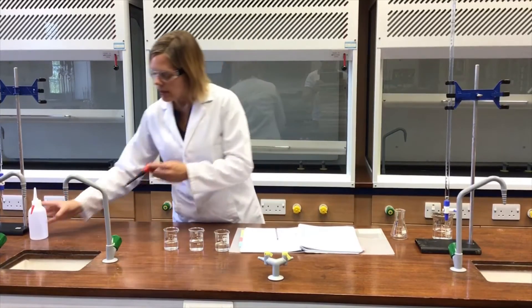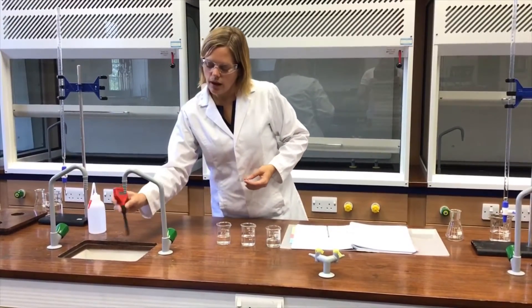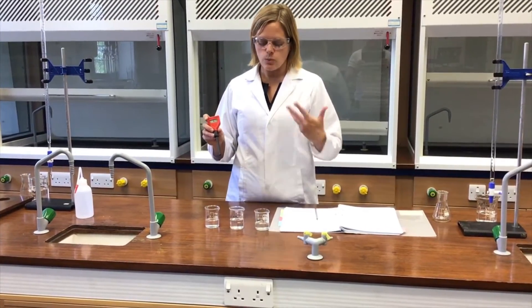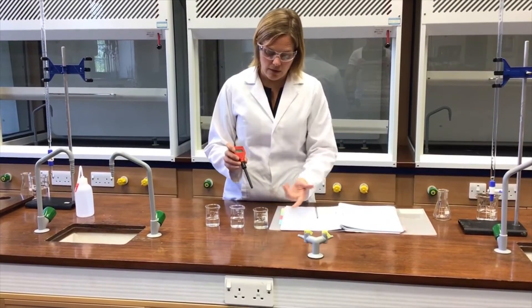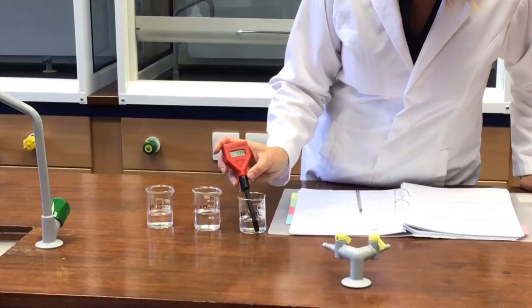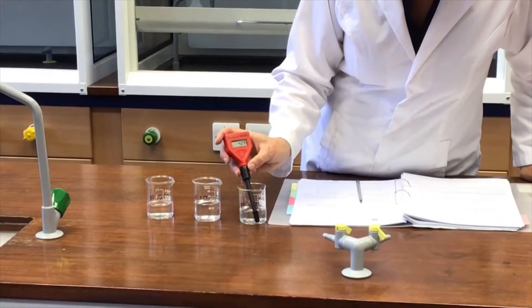I'll take this pH meter and give it a little rinse off with some distilled water. What I will then do is pop it into the first of three different buffer solutions. A buffer solution has a well-known pH — they've been made up carefully. This first one is pH 4, so I know that the pH is 4. It's important to just let it settle for a few moments, as it drifts a little bit.